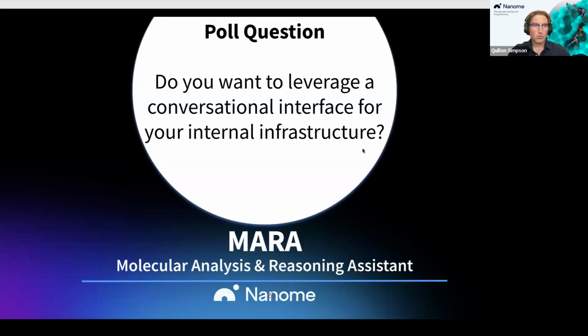Furthermore, in that hypothetical example where we're interacting with Mara to understand the outcome of an experiment, it could be possible to interact with data contained within your ELN interactively and have it as a front-end search tool to search your ELNs in Revvity. Just as a couple of potential ideas.